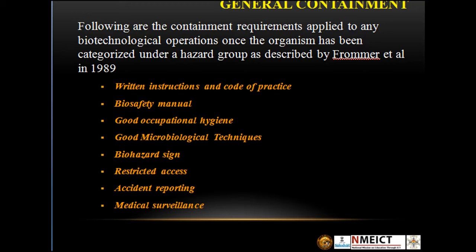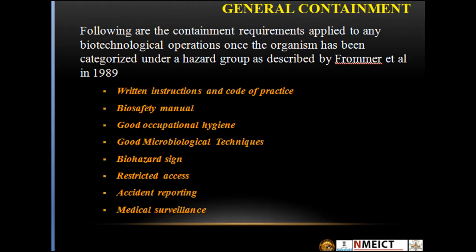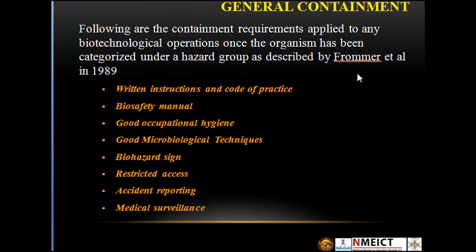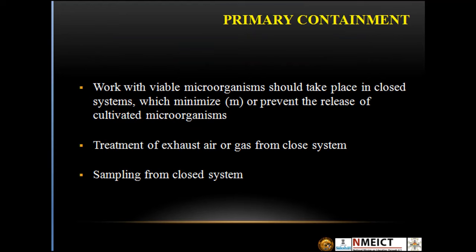There are many containment requirements applied to any biotechnological operation once the organism has been categorized under a hazard group, as described by Fromer et al. in 1989. These general containment requirements include: written instructions and code of practice, biosafety manual, good occupational hygiene, good microbiological techniques, biohazard signage, restricted access, accident reporting, and medical surveillance.